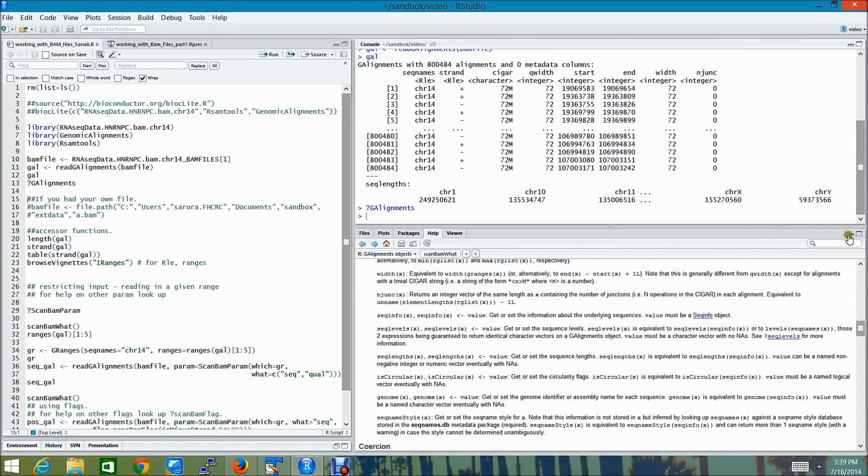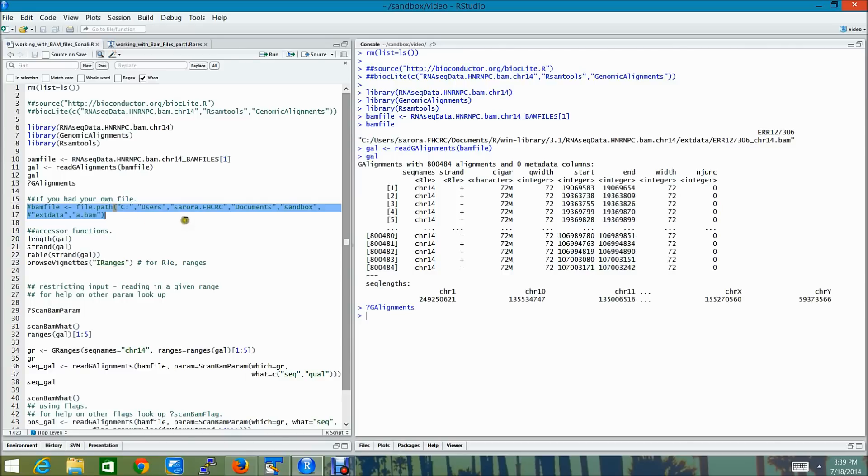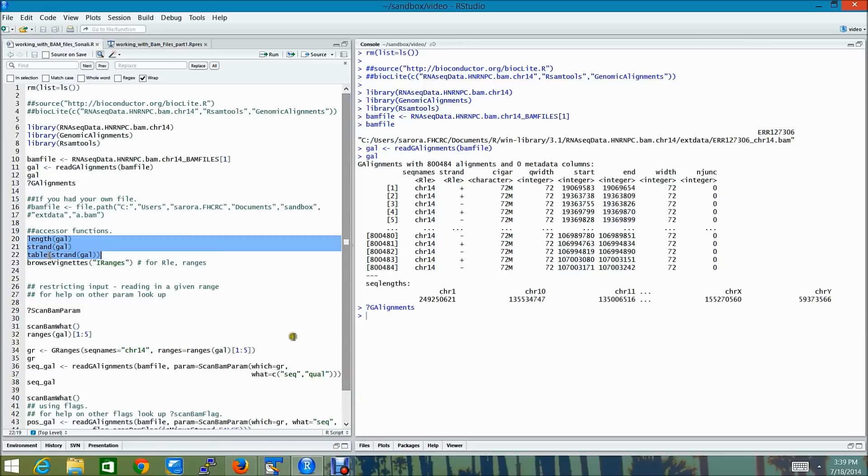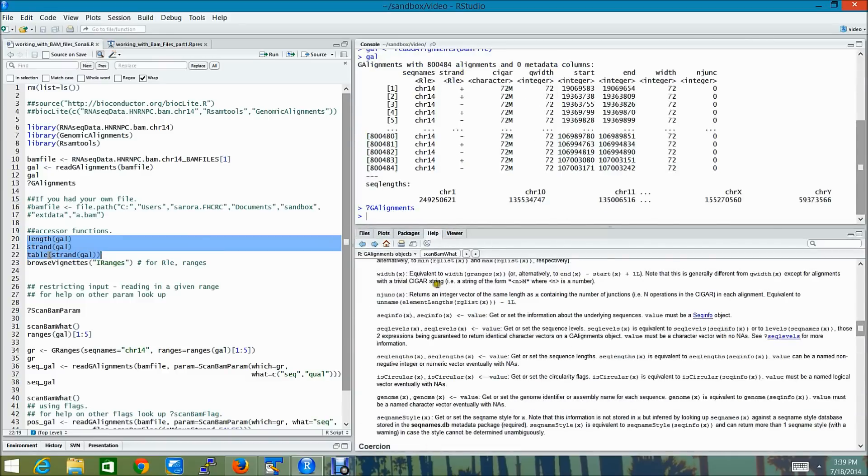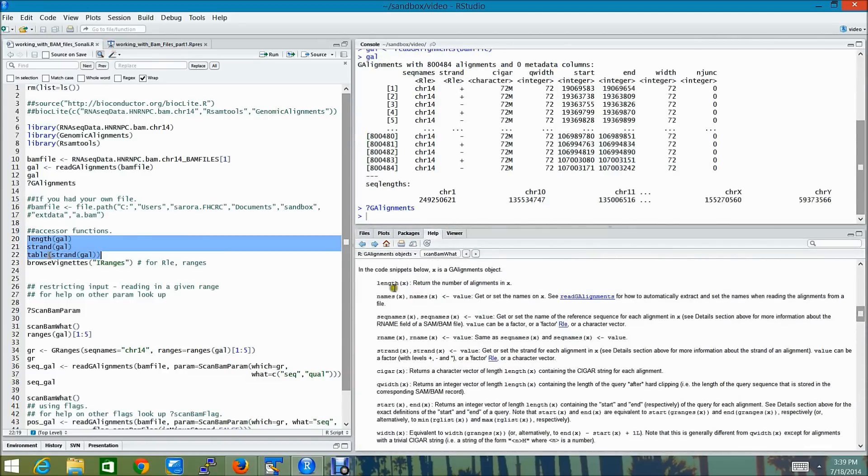If you had your own BAM file, you would probably use file.path and specify the exact location of your BAM file. Just like I have shown in these commented out functions here. There are actually several accessor functions also available. For example, length, strand, and again you can find all these accessor functions here.